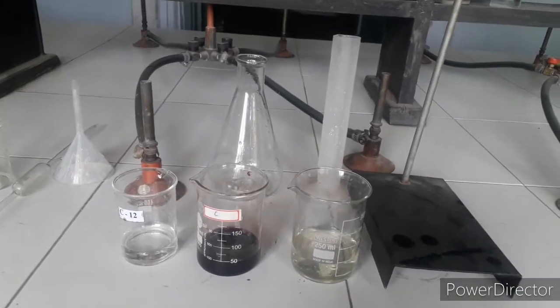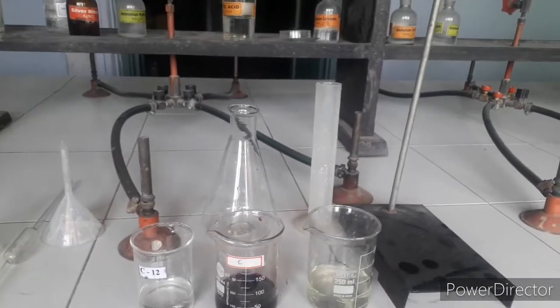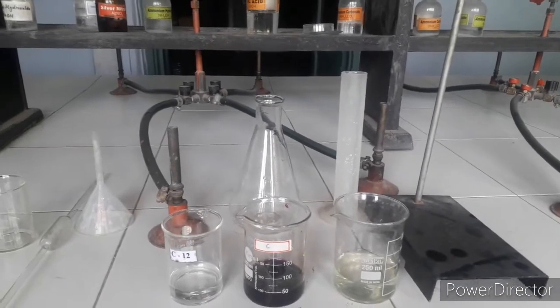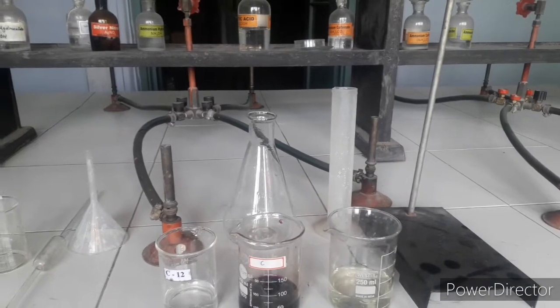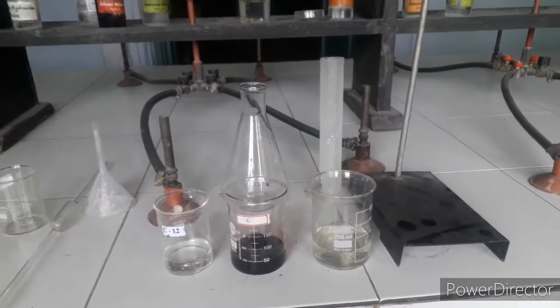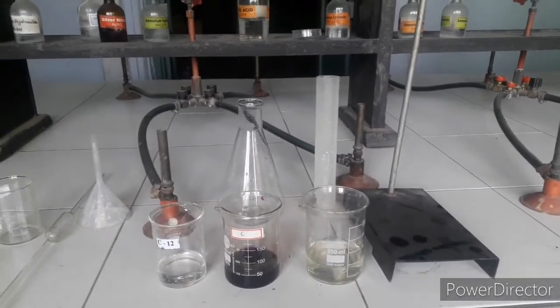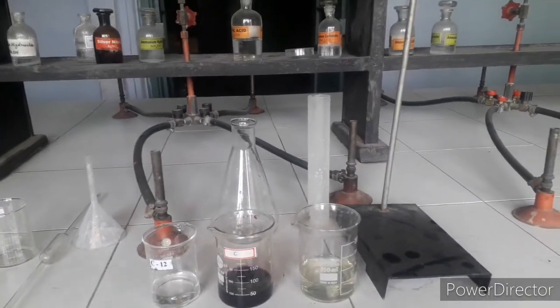In Class 12 we are focusing on a new topic in your practical — titration. You have already done titration in Class 11 but that was a different one. Today we'll do the titration between hydrated ammonium iron(II) sulfate against potassium permanganate — KMnO4, also written as potassium per-manganate in some books.